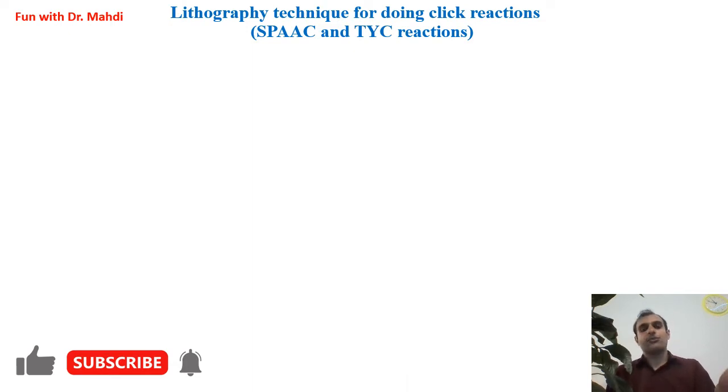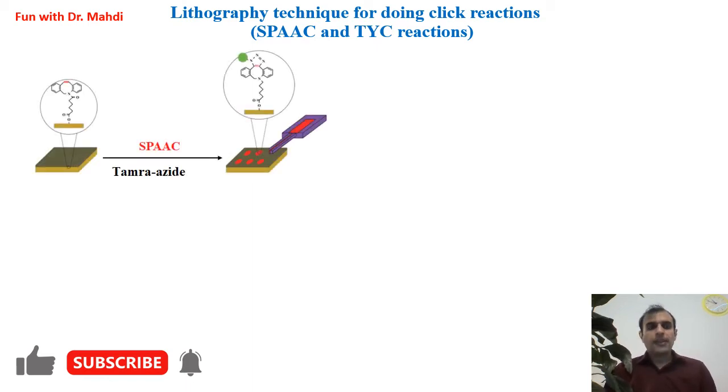SPAAC is strain-promoted alkyne-azide cycloaddition, and this one is thiol-yne coupling. First, you need to functionalize the surface with alkyne. You have alkyne on the surface. In the next step, for doing the click reaction, SPAAC, it's a click reaction between alkyne, cycloalkyne, and azide.